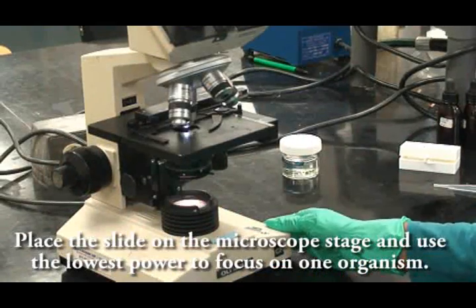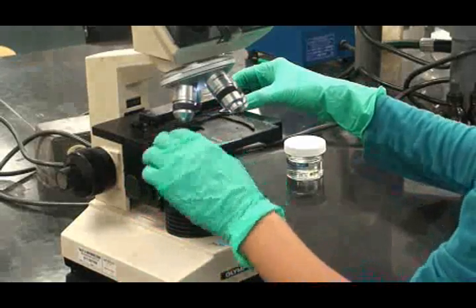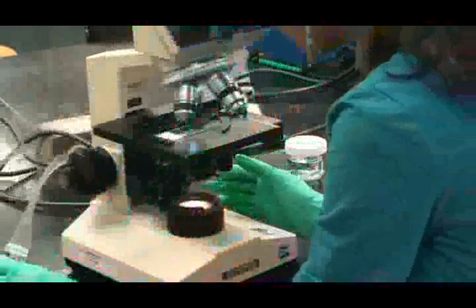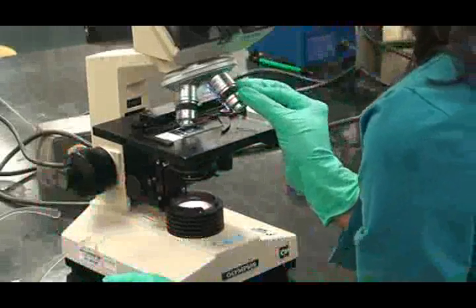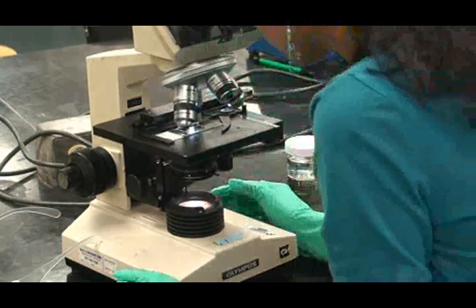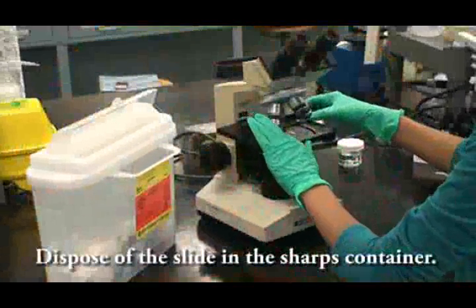Place the slide on your microscope stage and use the lowest power to focus on one organism. Increase the magnification progressively up to the highest dry objective. Dispose of the slide in the sharps container.